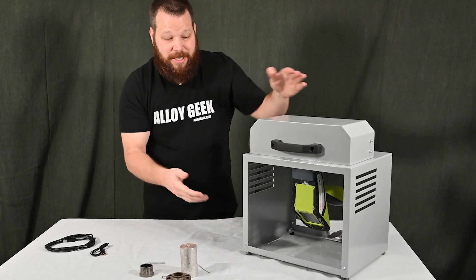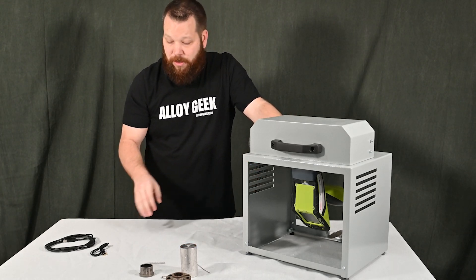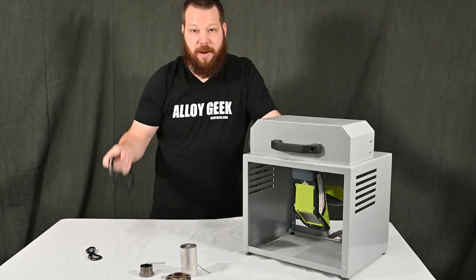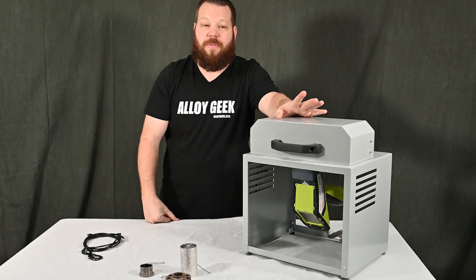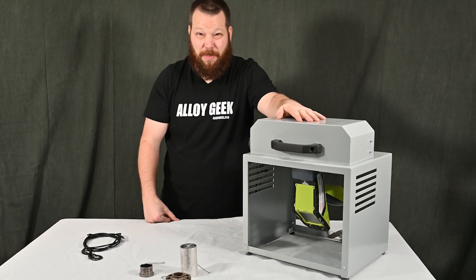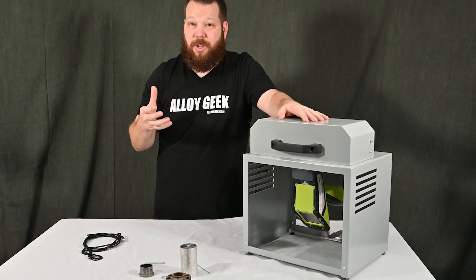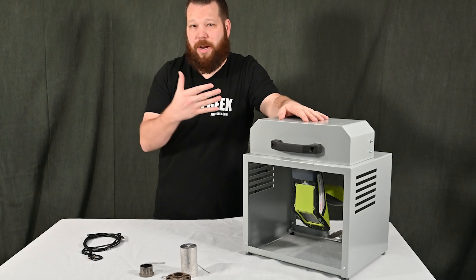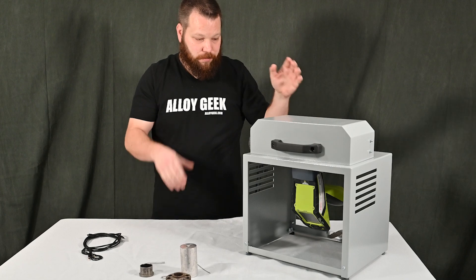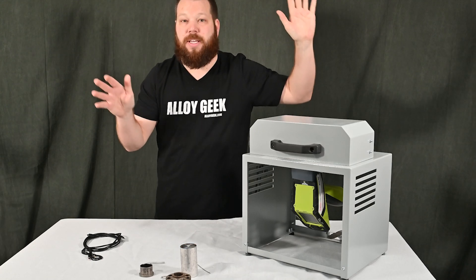Another reason to use this XL test stand is for circuit boards — they can be really big, and you might want to target individual solder joints looking for RoHS compliance. It's very easy to do. Keep in mind that XRF analysis typically hits gold and jewelry at about 20 microns depth — that's considered infinite thickness — so we're not looking at anything very deep. If you want to verify a gold bar is pure, you'll have to drill it; x-rays don't penetrate that far from the surface. This test stand operates with the same RFID technology and has that same soft-close feature.